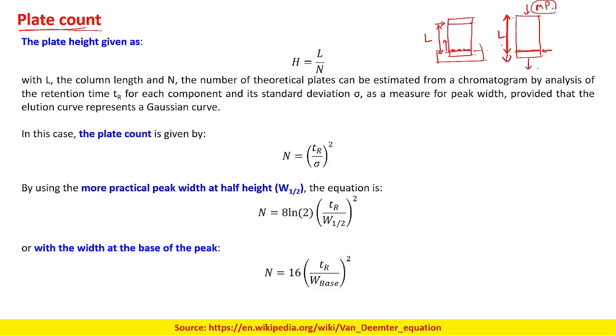Basically, what I want to say is that it is the portion of the column which you are utilizing for the analysis of your analytes.